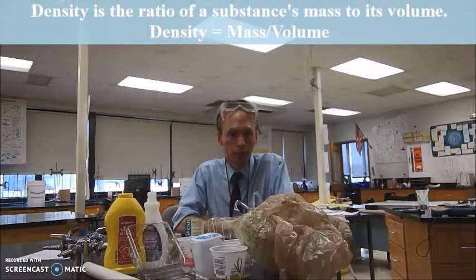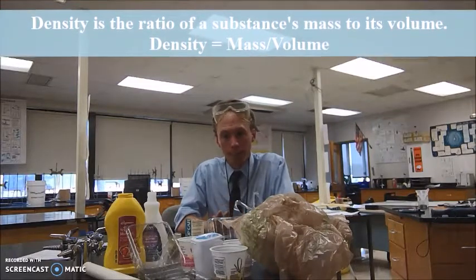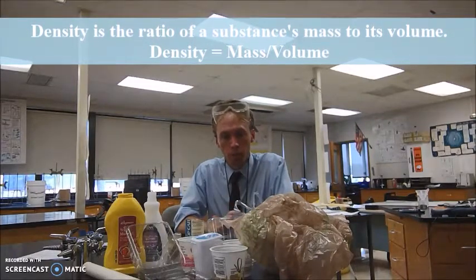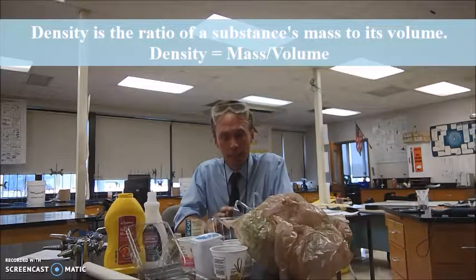We're going to take a look at how we separate these plastics into their different types. For a previous lab, the mass and volume lab, you looked at the relationship between the mass of copper and the volume of copper, and you also looked at the relationship between the mass of tin and the volume of tin. You saw that you got a unique density relationship for each metal. We're going to use that same principle, that each type of plastic has a different density value.